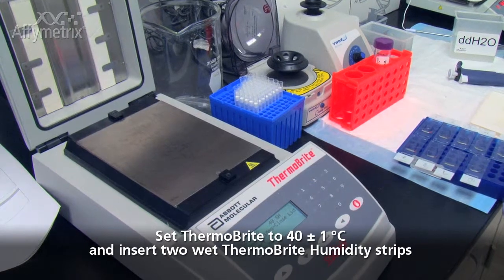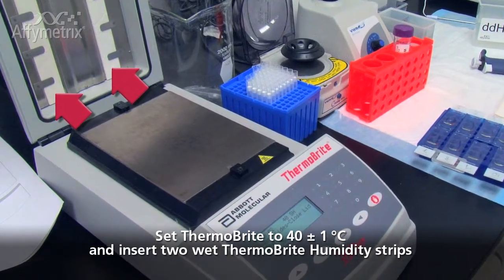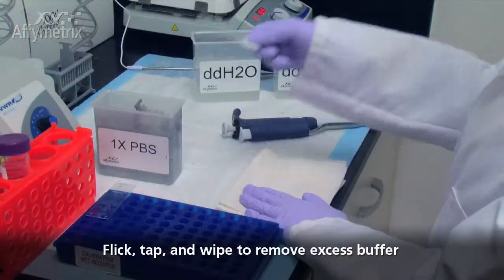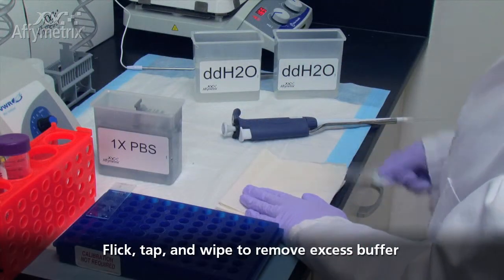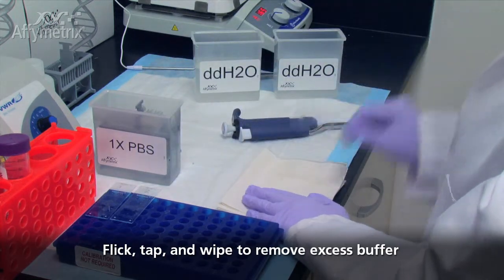Set the Thermobrite to 40 degrees Celsius and insert two wet Thermobrite humidity strips if you haven't already done so. Remove each slide and flick it to remove excess buffers. Tap the slide on its edge, then wipe the backside on a laboratory wipe.